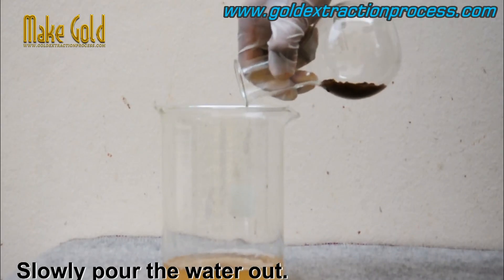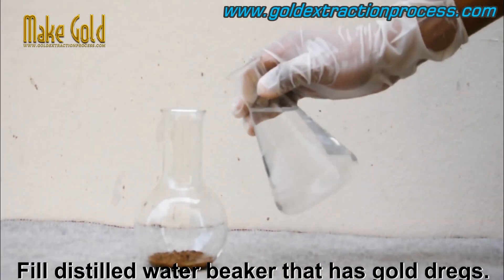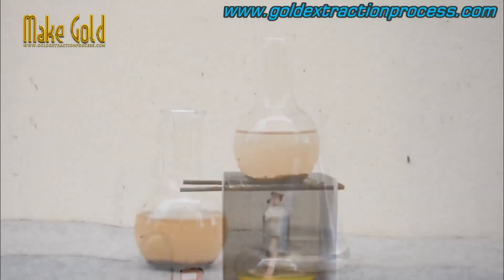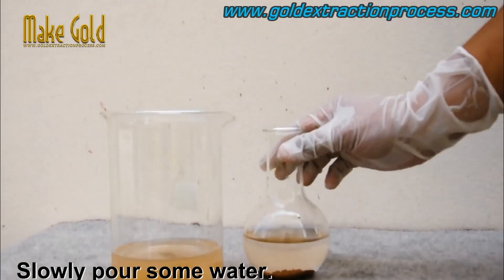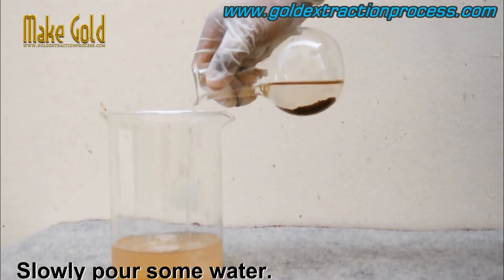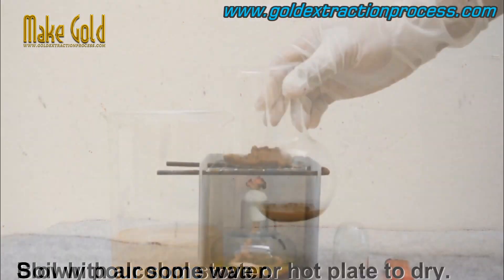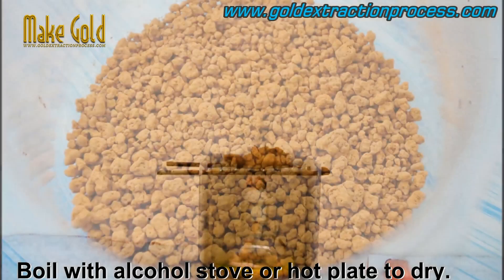Filter the solution to separate the gold powder from the remaining liquid, typically using filter paper or another filtration method. The gold powder is then washed several times with water to remove any remaining impurities or acid, and finally dried using heat or air before being melted into a bar or other shape.